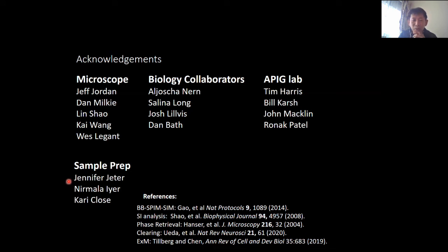Not too much. I'll just lead on to the next question, which is, I guess, going back to Yurika's previous question on phase retrieval. I quite like what you have done, but from recollection, it's tough to calibrate the objectives. And what you're saying is that you can take the point spread function and retrieve the phase of that. I guess that's only specific to a given field of view. Am I correct? And if we were to look at a larger field of view, that particular function would change.